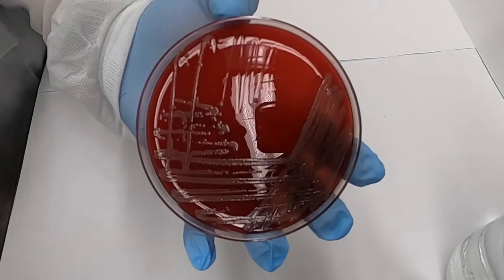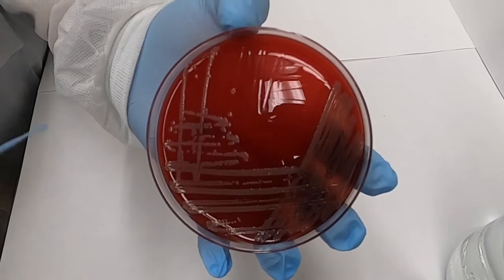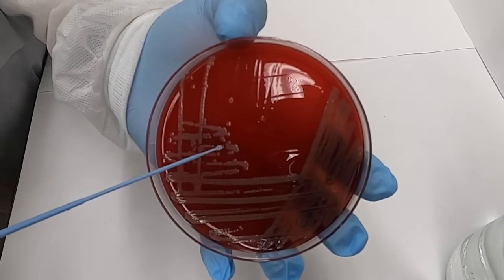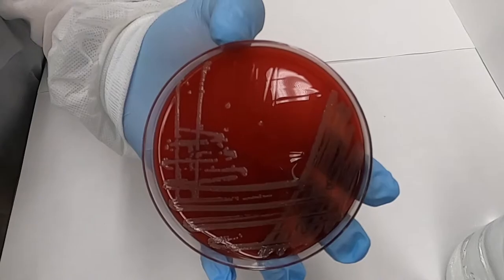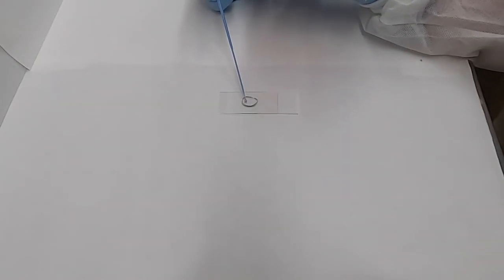Next, you're going to use a sterile loop to select a colony in which you'd like to visualize. Remember, just touch the tip of the colony. There's billions of bacteria there and you only need a little bit. Spread those around, get a nice even layer and wait for your slide to dry.